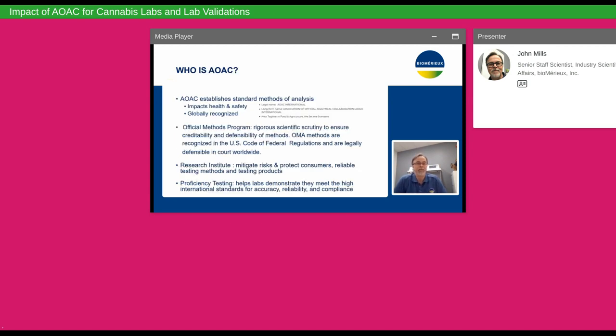So first, who is AOAC? AOAC basically establishes standard methods of analysis. These standard methods of analysis impact health and safety, and they are globally recognized. If you look at the AOAC webpage, they have some information on their legal name. Their legal name is AOAC International. The long form name is Association of Official Analytical Collaboration, AOAC International. And their new tagline has evolved into "In Food and Agriculture, we set the standard." The organization name has evolved throughout the years, and we will discuss this further in the presentation.